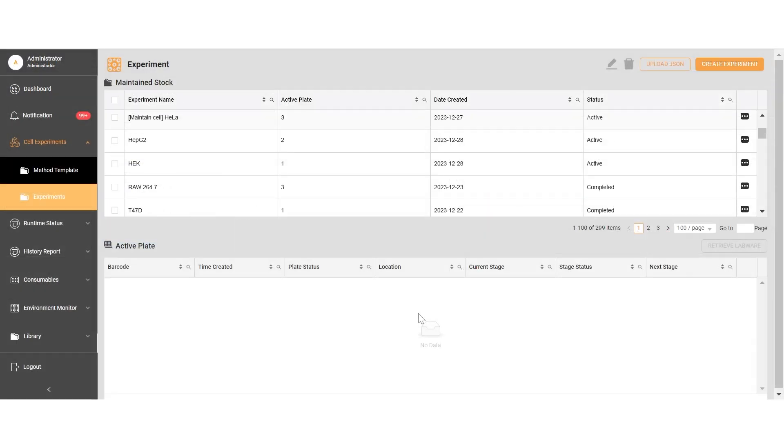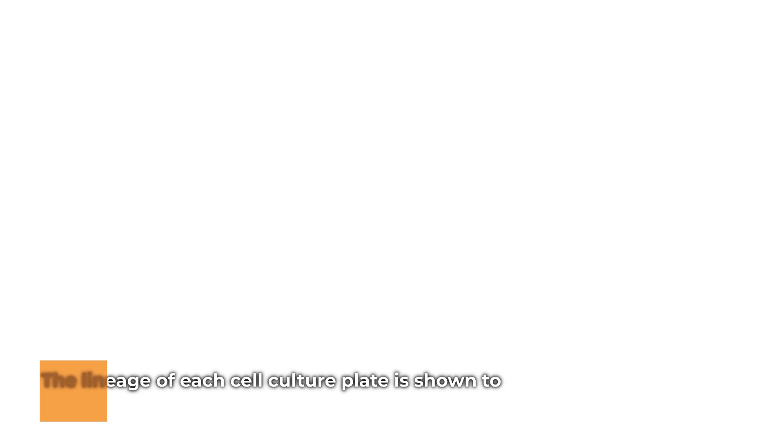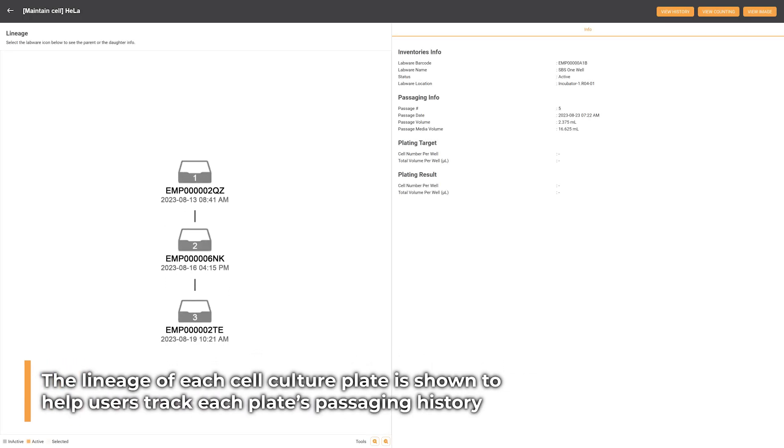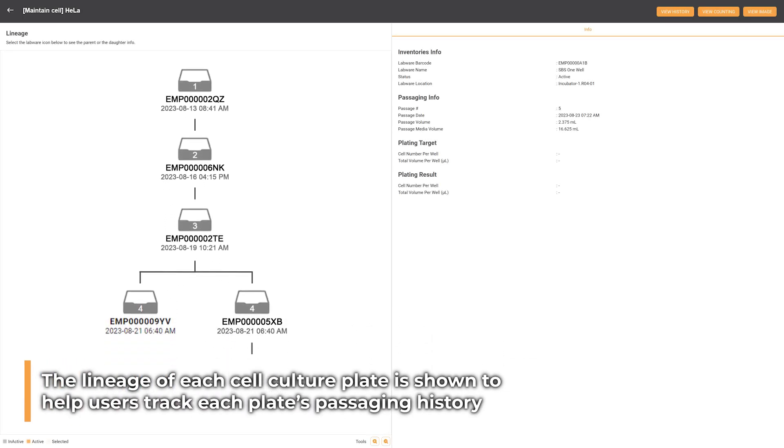In the Cellmatic suite, users can observe the cell growth through the confluency imaging analysis. The lineage of each cell culture plate is shown to help users track each plate from a specific seeding cell number and passaging history.